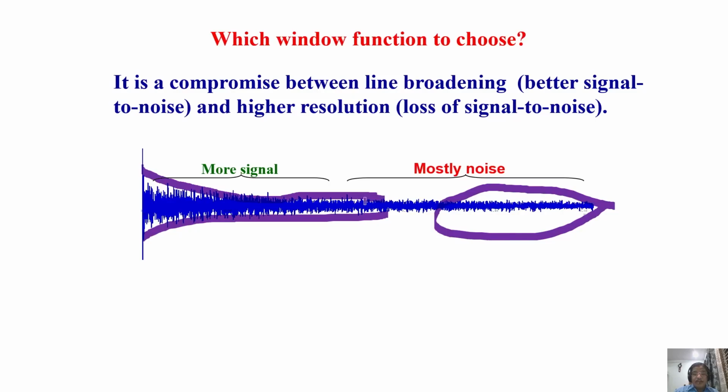Okay. Now, if I collect the signal for a longer duration, I told you how to optimize the spectral width in the previous one or two classes. There is no need to collect the signal for infinite time because you will be collecting only noise. And you cannot also cut the FID like this. You'll be truncating, giving rise to sinc artifacts in the frequency domain. So you should have an optimum. But anyway, you also have to have very good digital resolution. Many parameters you have to optimize. Let us say you have collected the signal.